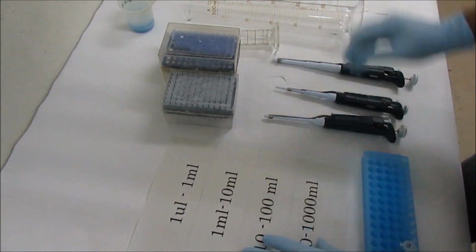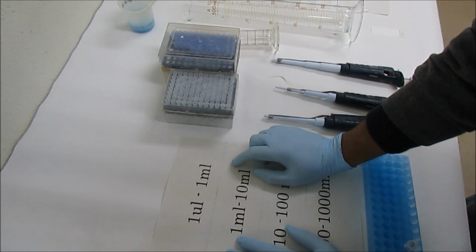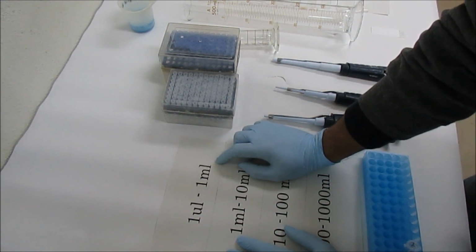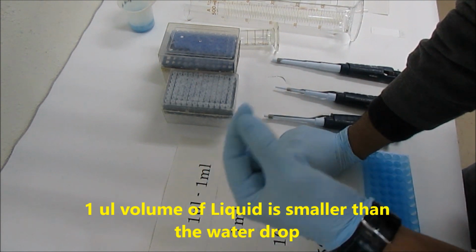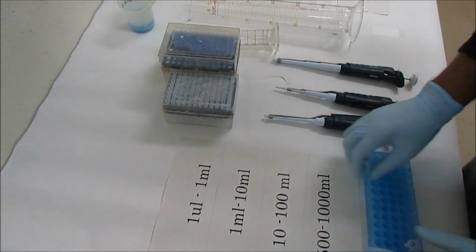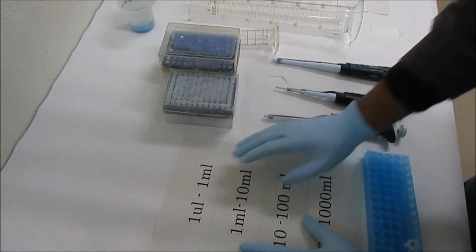Today I'm more focused on measuring liquids from 1 microliter to 1 ml. This is a very small volume. 1 microliter is smaller than a water drop. So how can you measure this very small volume so accurately and precisely?